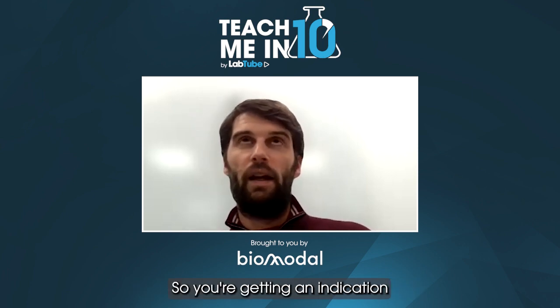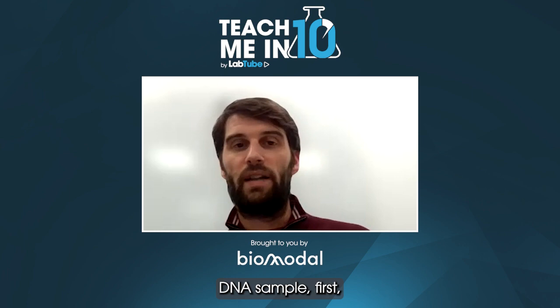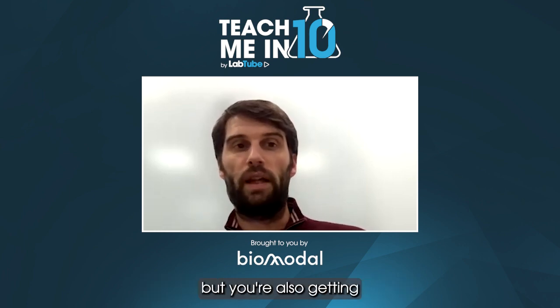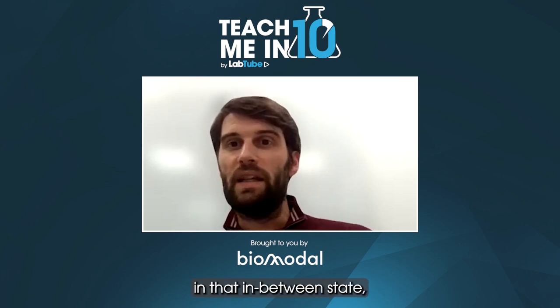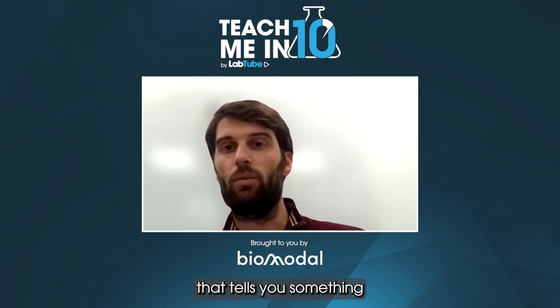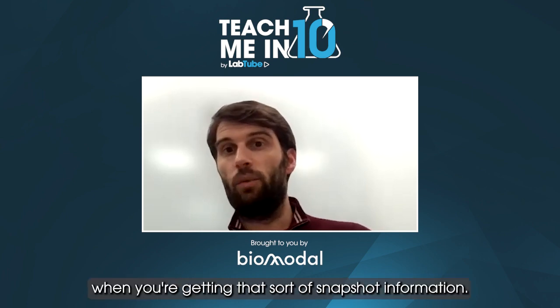So you're getting an indication, within a cell-free DNA sample, firstly, of an entirely new feature you couldn't otherwise get. But you're also getting, in that in-between state, that primed state, where you have a mixture of MC and HMC, some information that tells you something about what might be happening in the future, because you know that region is about to be activated, even if it isn't active when you're getting that snapshot of information. What does the workflow entail to generate this level of data and insight?